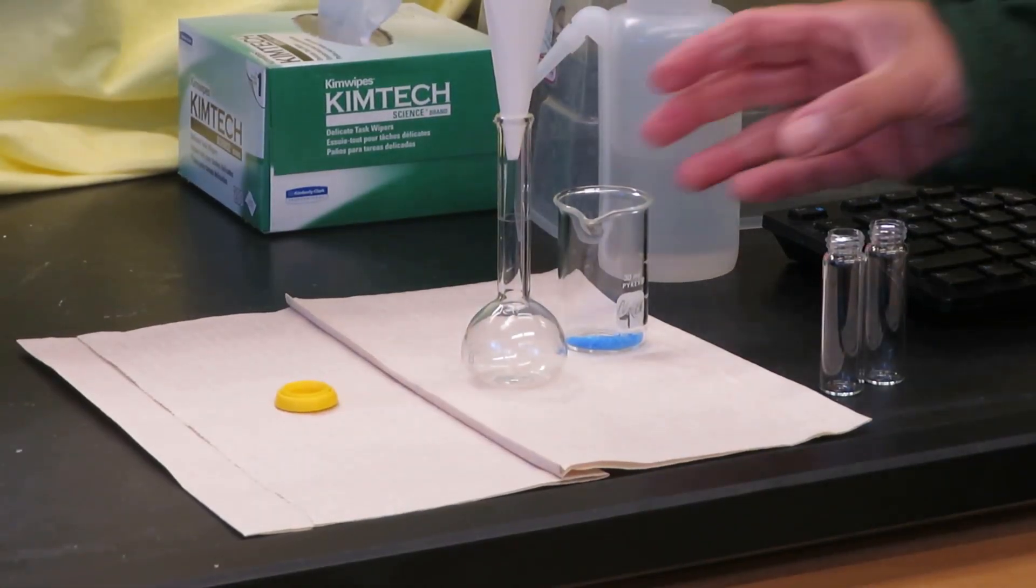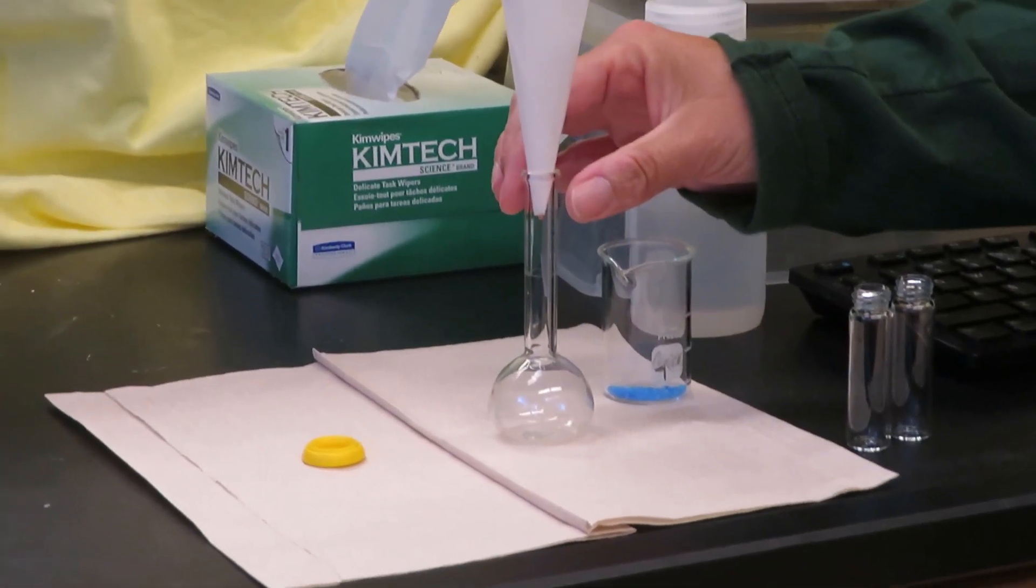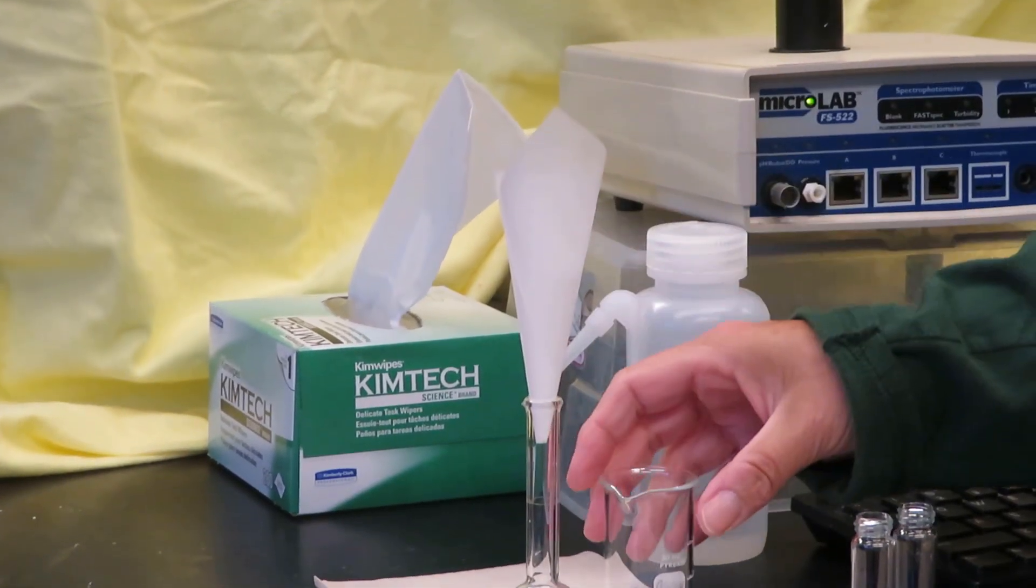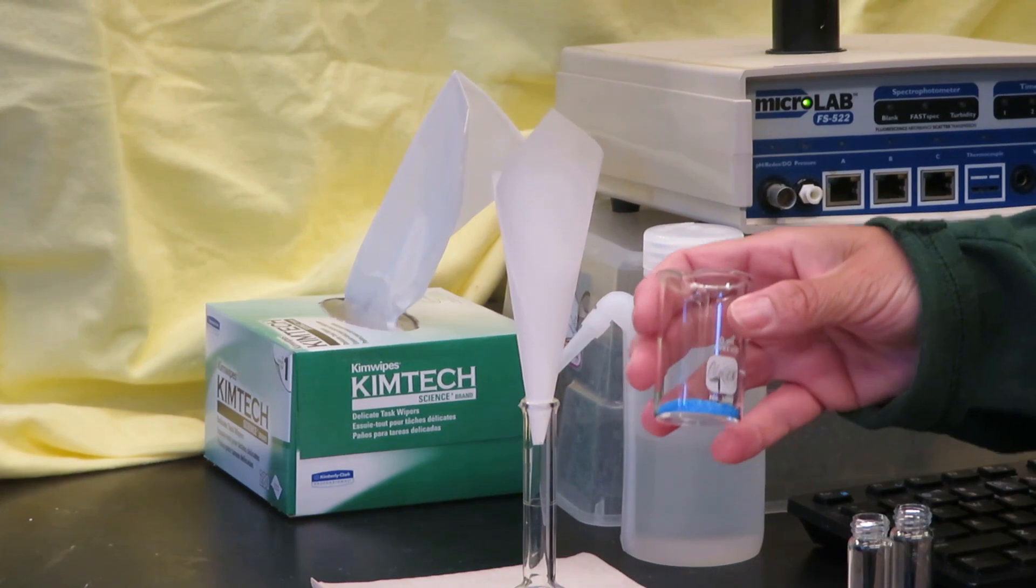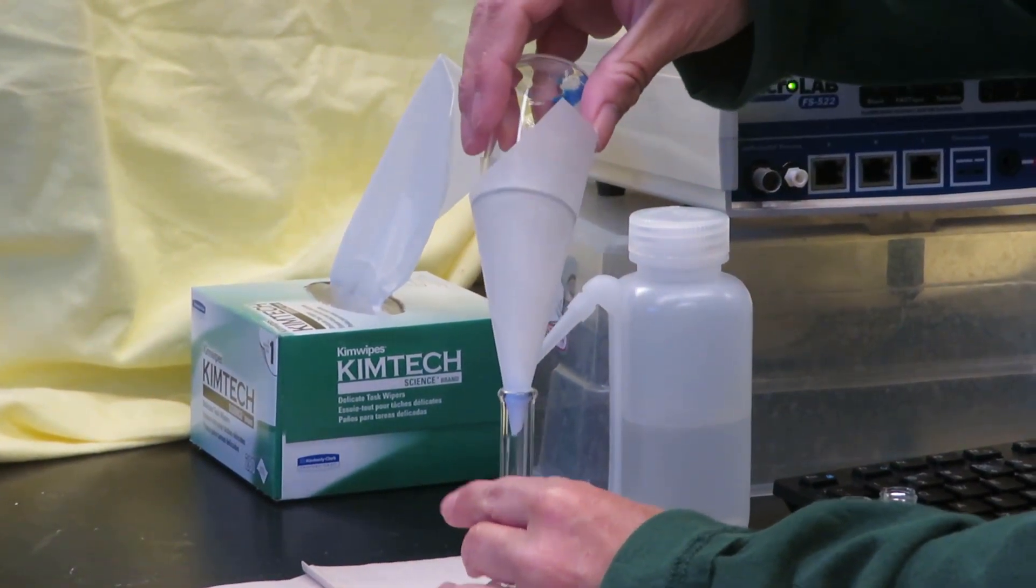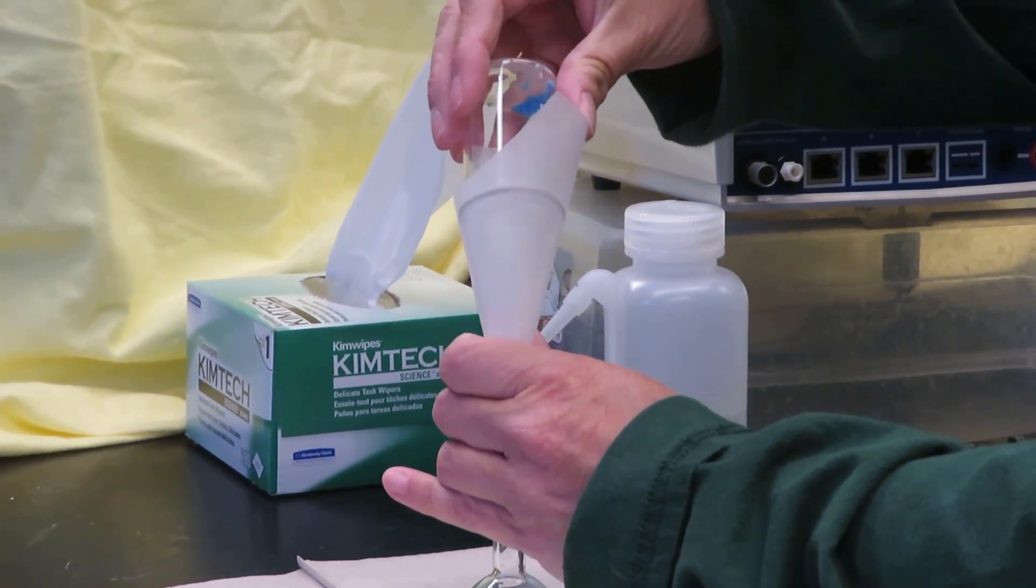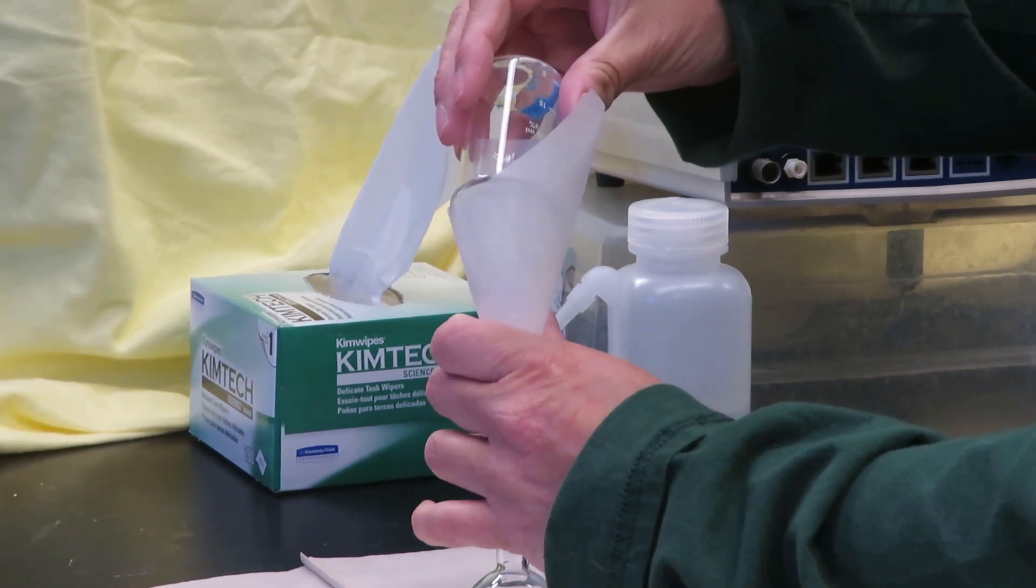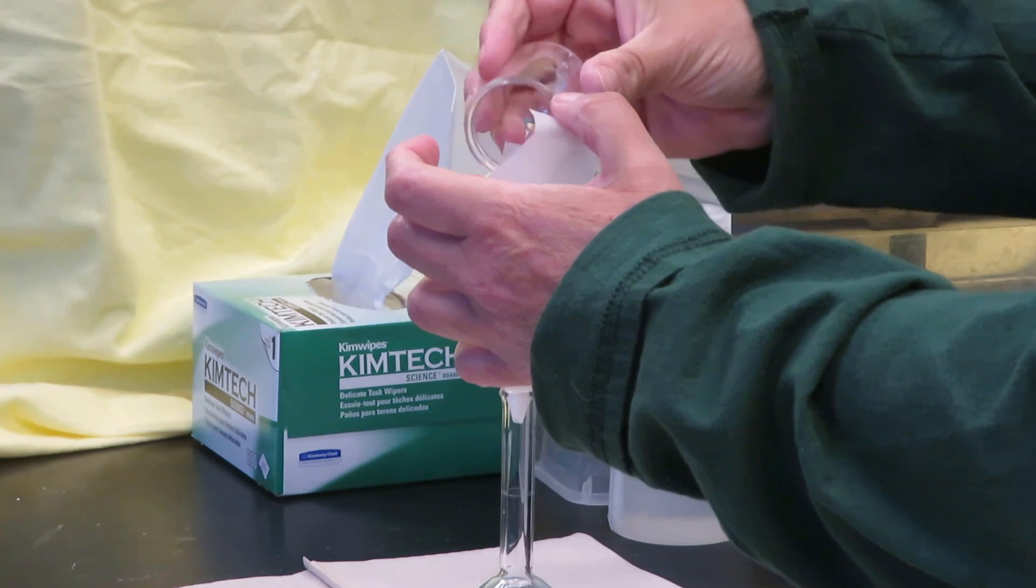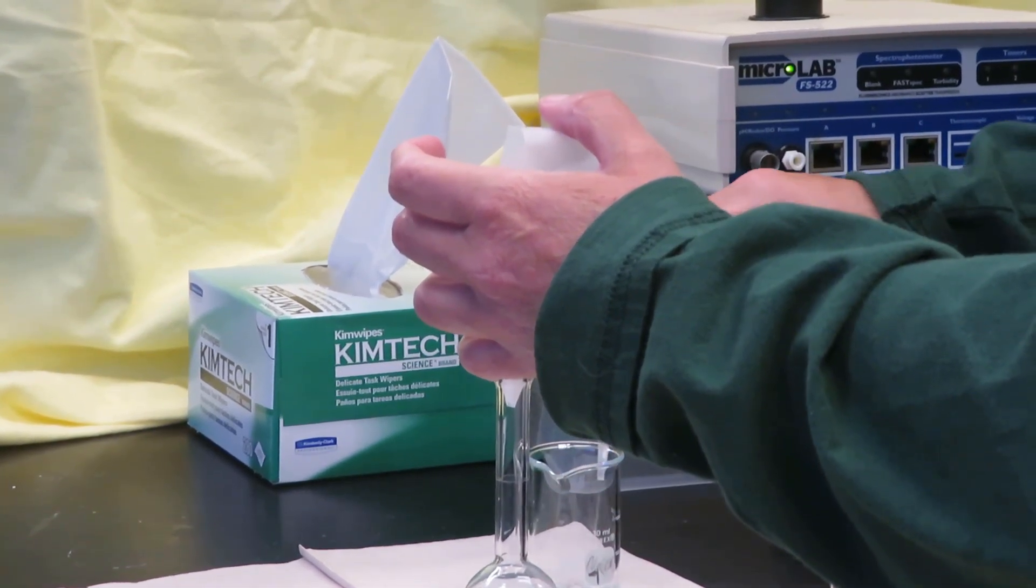Now I need to transfer the solid that I weighed into the 25 milliliter volumetric flask. I've made a funnel to help with the transfer, so it doesn't spill all over the place. I'm going to pour it in. There will be some left in the beaker and the funnel. I want to make sure that I transfer all of it.